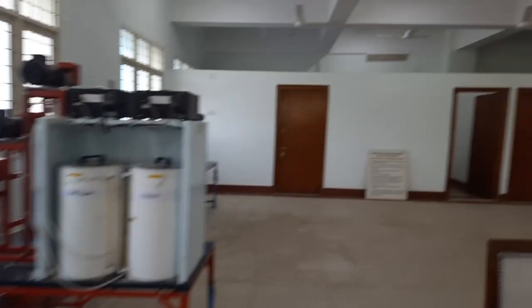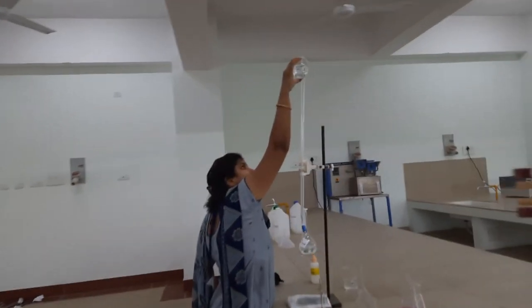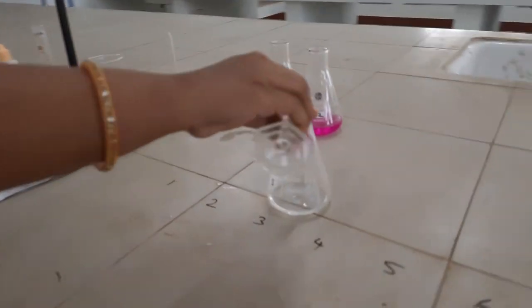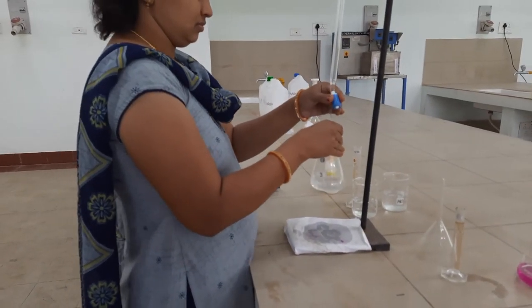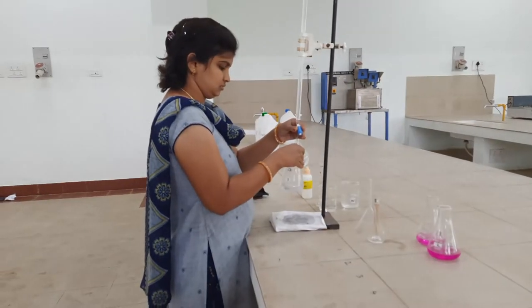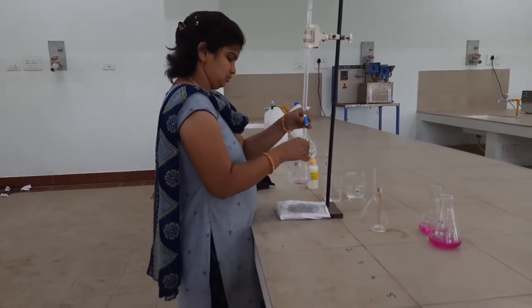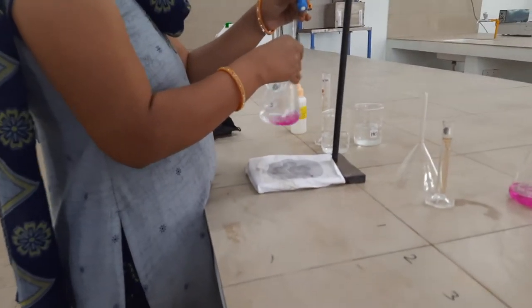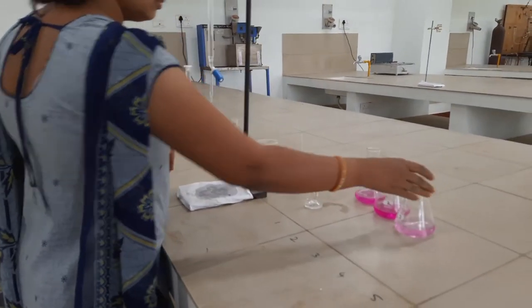Start the titration. Before starting the titration, again refill the burette with 0.05 normal NaOH solution up to zero level, add the 10 ml sample collected to the third conical flask and titrate it against NaOH solution and note down the endpoint. The endpoint is the appearance of permanent pale pink color. That's a perfect endpoint. Note down the values.